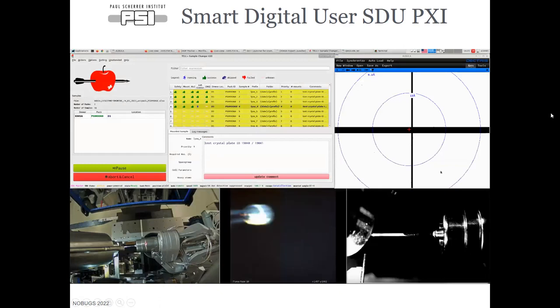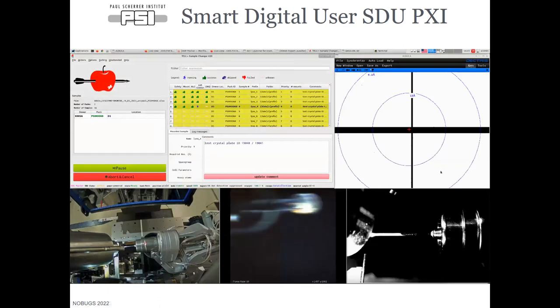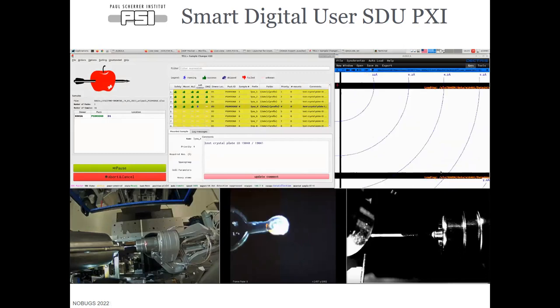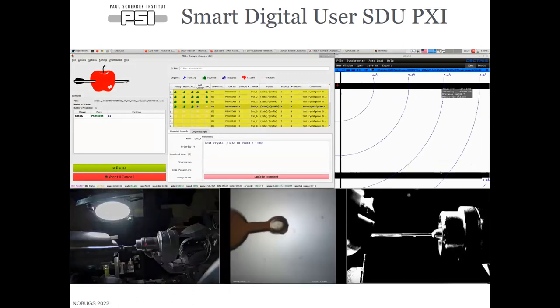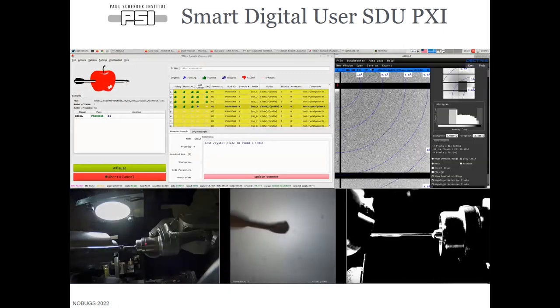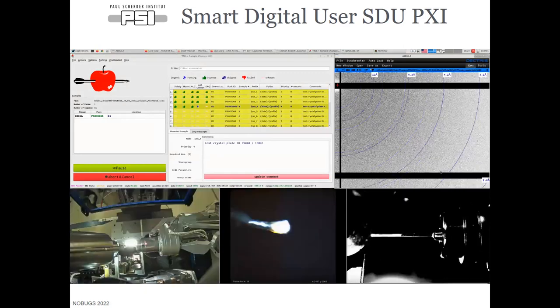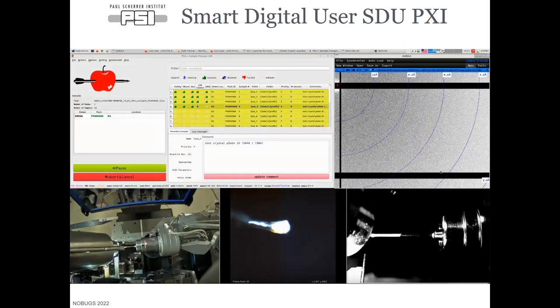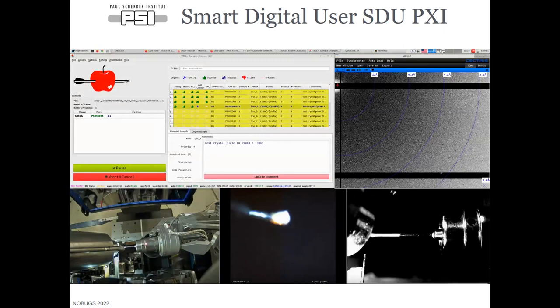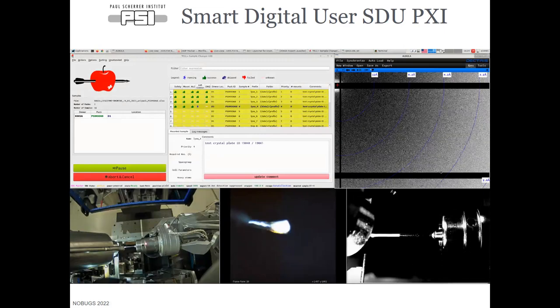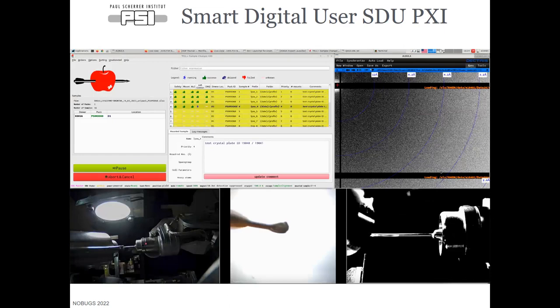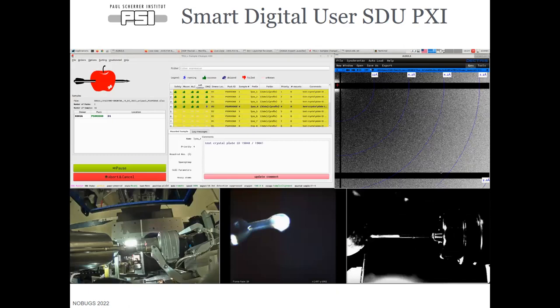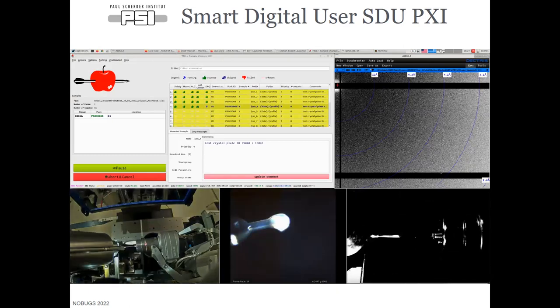Our diffraction centering is now running. All of these images — we're taking the zero-MQ stream and processing them live on our computing nodes, using LABELIT and spot finding, so the results are instantly available for SDU to make the decision on where it should align first. We then do a secondary alignment at 90 degrees. Once this is done, SDU is able to determine where it wants to measure the data, and we collect according to the information our users provided in the spreadsheet.